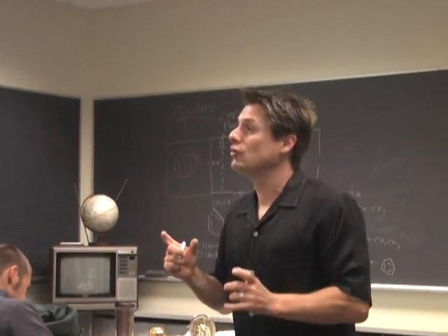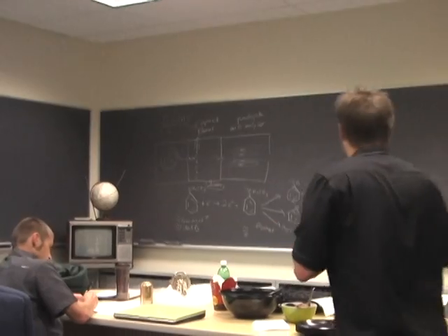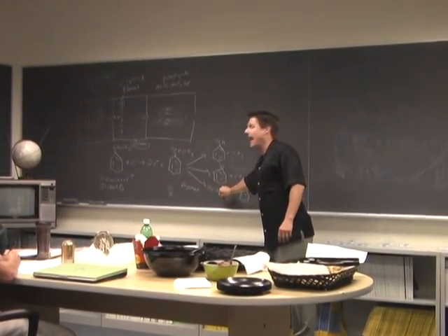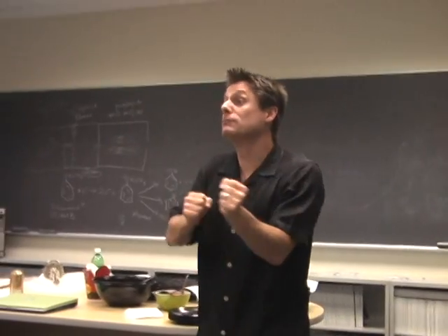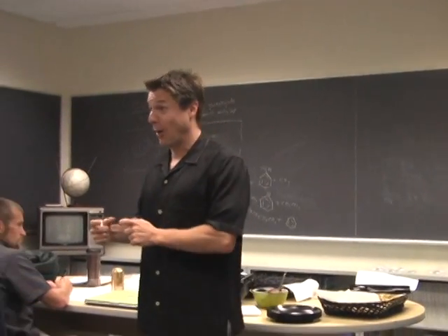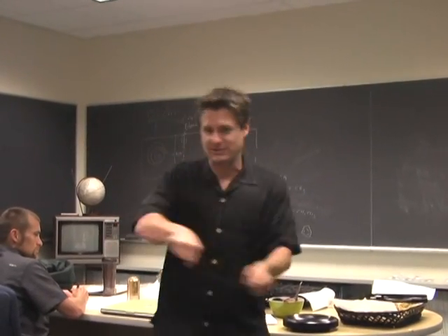The other one has to do with the size difference of big ions and small ions. Would you agree that this ion has a bigger mass than that one? So I'm going to take advantage of the size difference and how they maneuver. My favorite example is the difference between the Titanic and a speedboat. If the Titanic was a speedboat, it would never have crashed into the iceberg because it would go right around it.